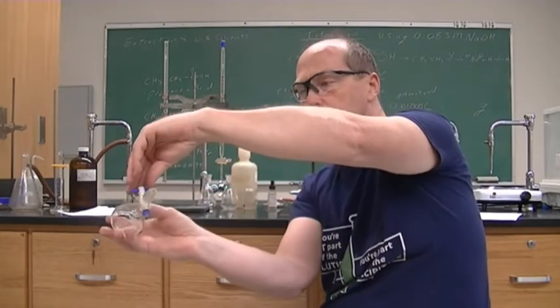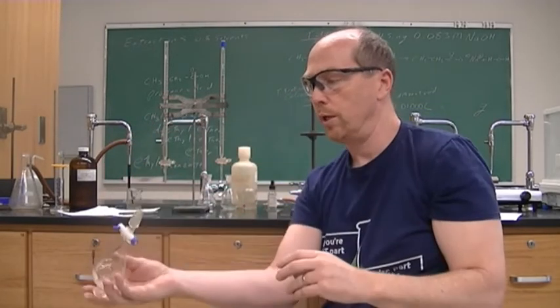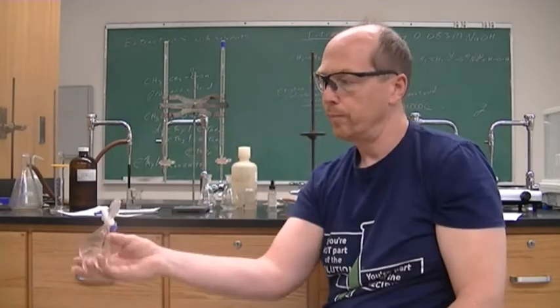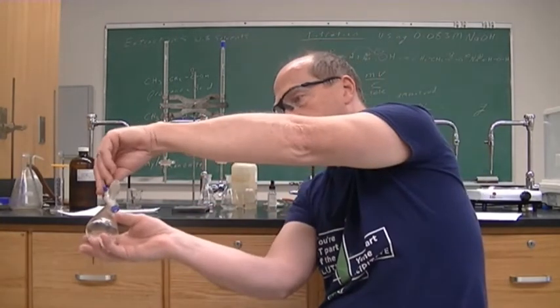So you don't point this at anybody, you point it away from people. You don't want to shoot ether at them or the propanoic acid with the ether at them.